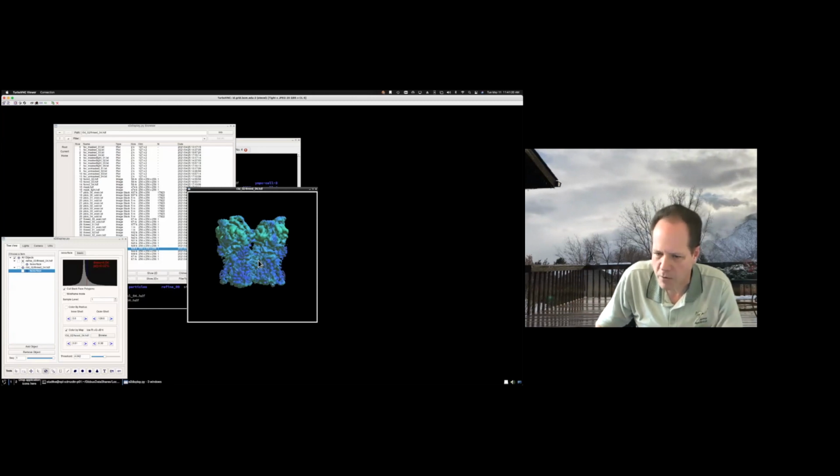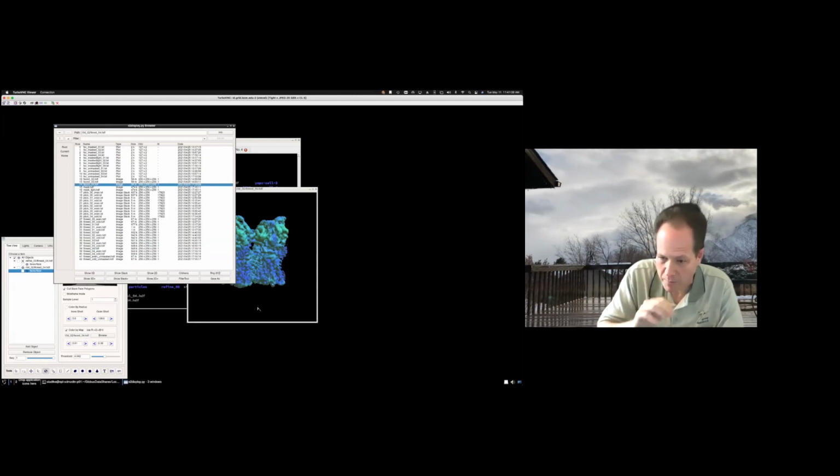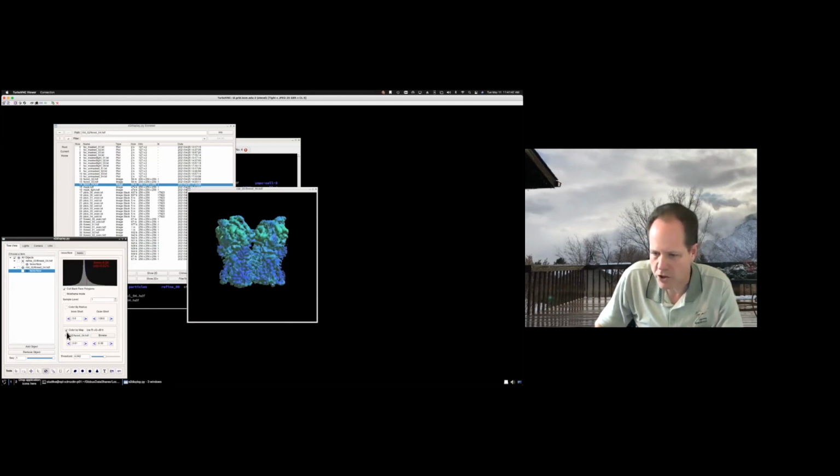So if you go to an EMAN refinement and you open a 3D volume and it finds a corresponding resolution volume that was done using this new MFSC that Penczek came up with, then it will automatically load it along with the 3D volume. You can turn it on and off here with the checkbox, and you can also adjust the limits. You can see here that the bluest limit corresponds to 0.38 reciprocal angstroms, so something around 2.8 angstrom resolution, and that the lowest resolution color corresponds to 100 angstrom resolution, which is why we're not seeing too much. I can raise the threshold there, and then we'll see it a little more.